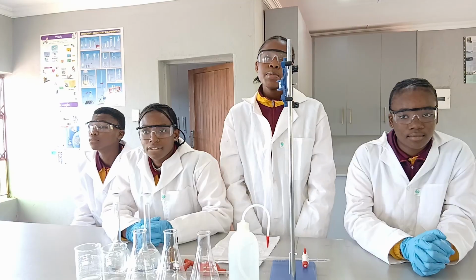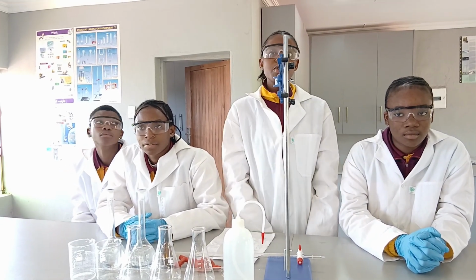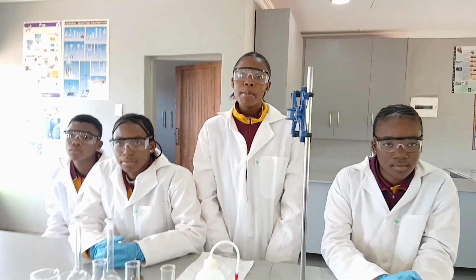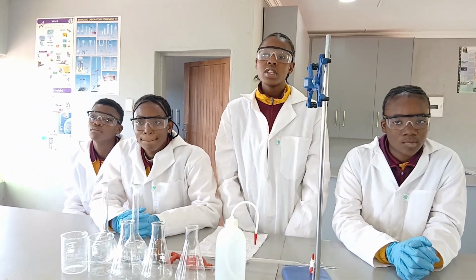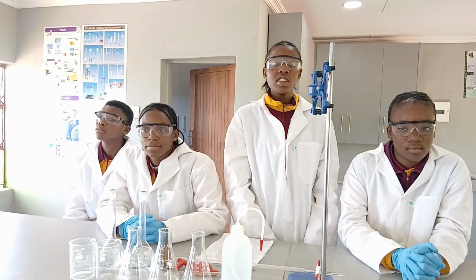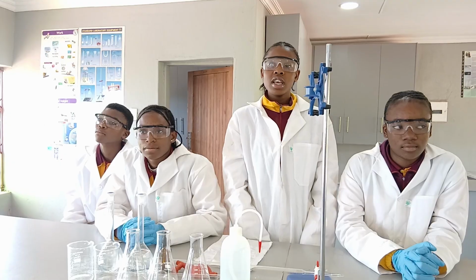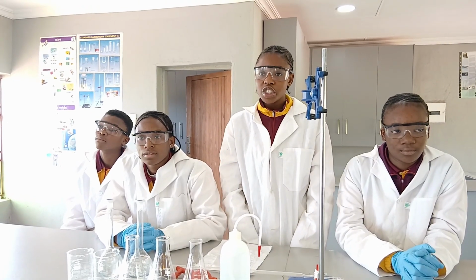Firstly, what is simple titration? Simple titration is an experiment that we use to find the exact amount of an acid which reacts with a base. This helps us to know the total amount of an unknown solution using a solution of known strength. Then, what is neutralization? Neutralization is a chemical reaction whereby an acid reacts with a base to form salt and water. It helps us to balance and neutralize a solution.